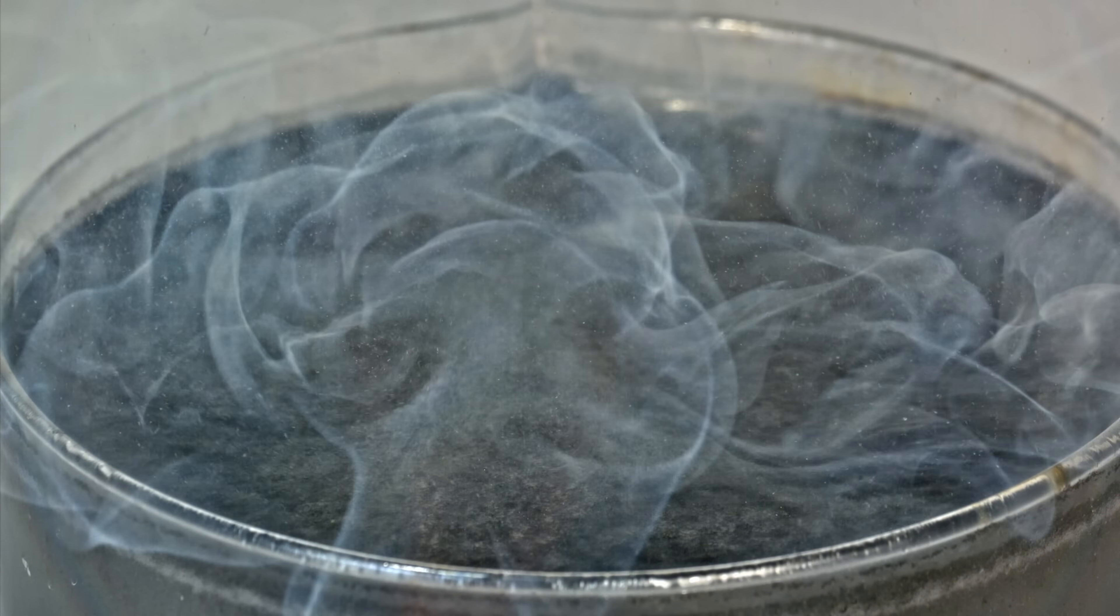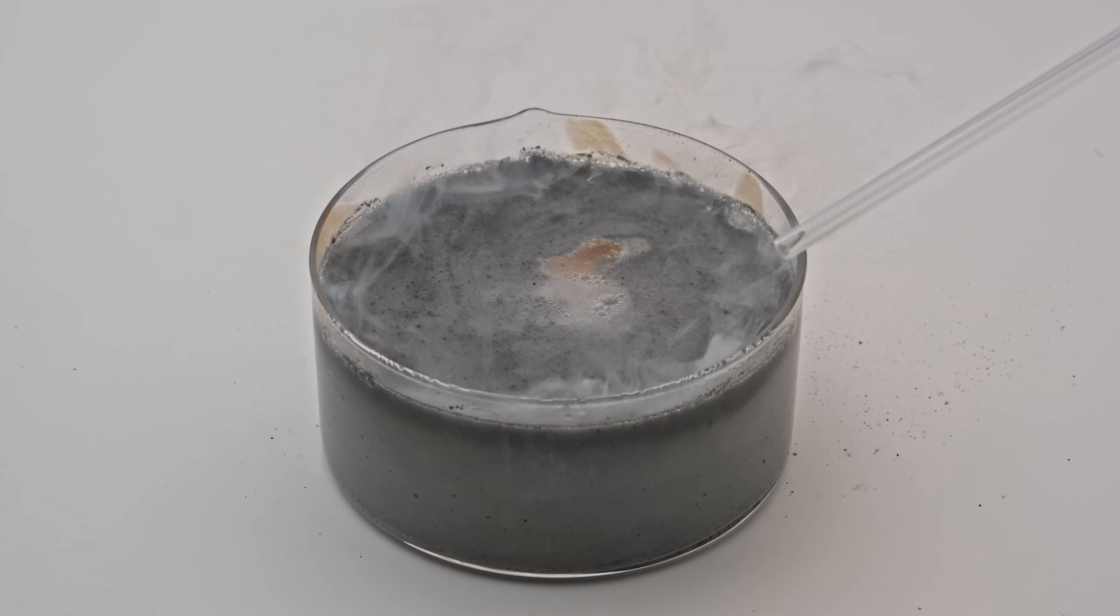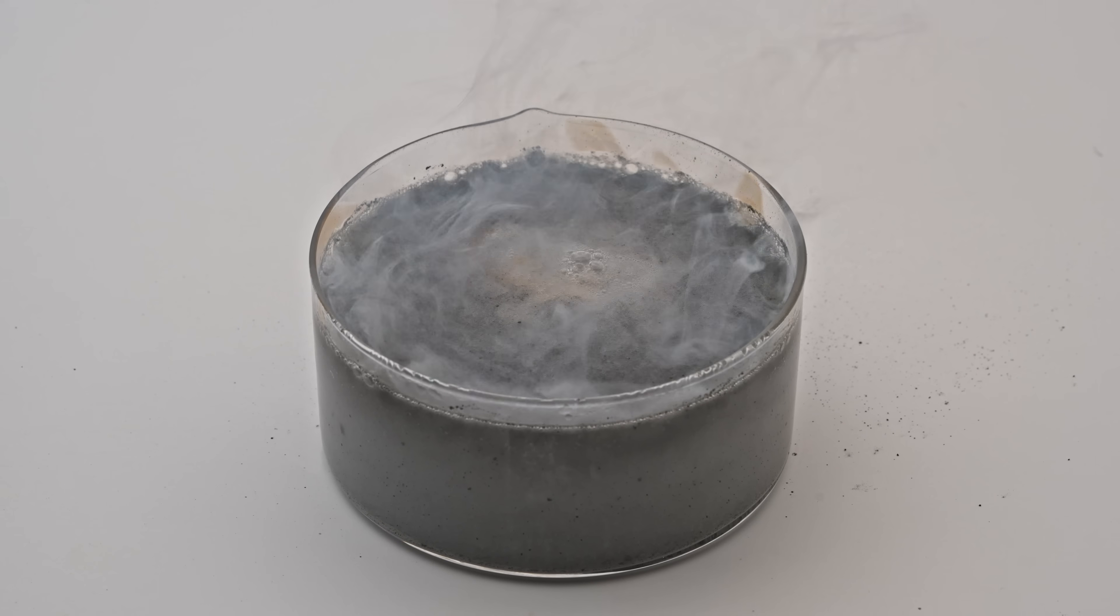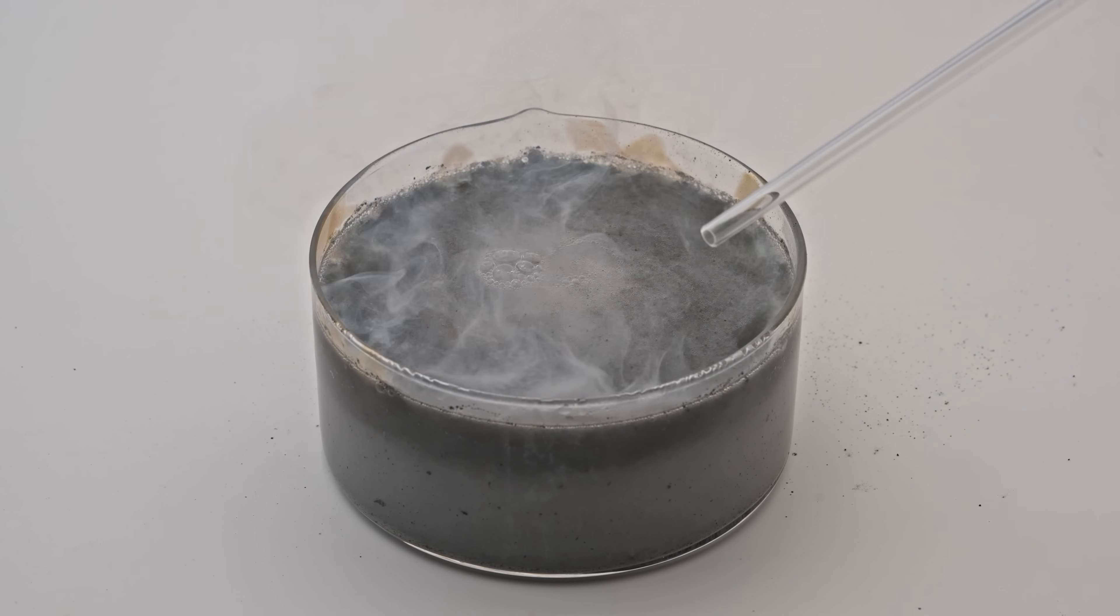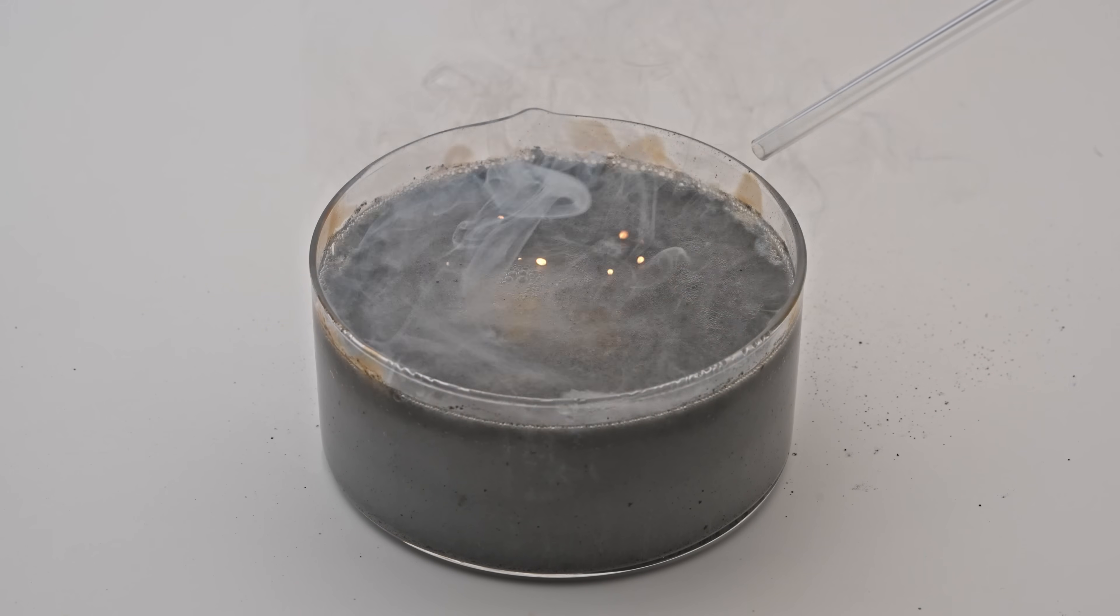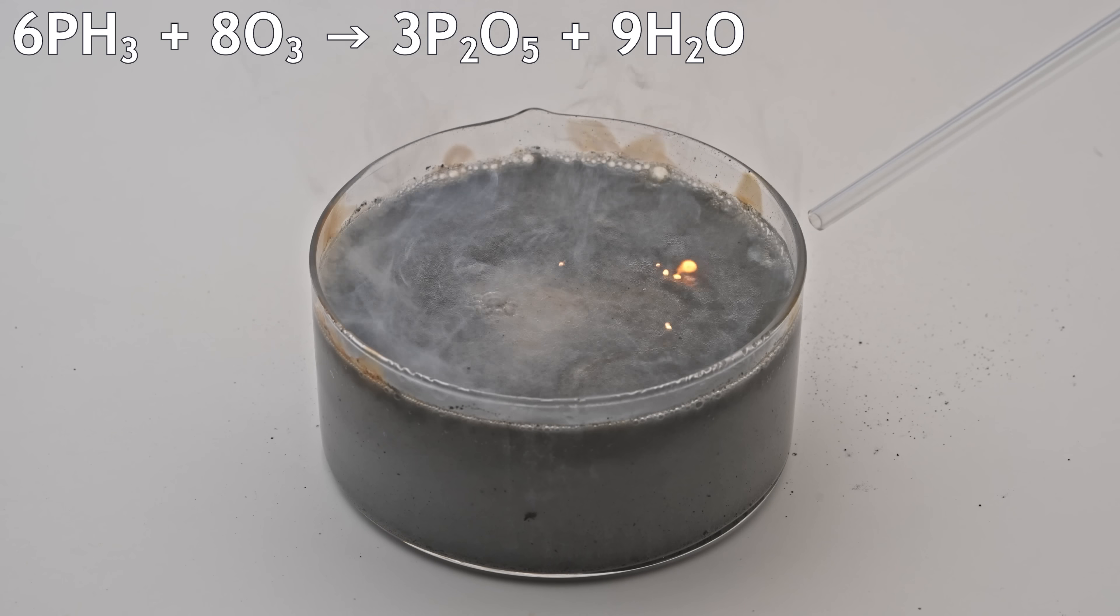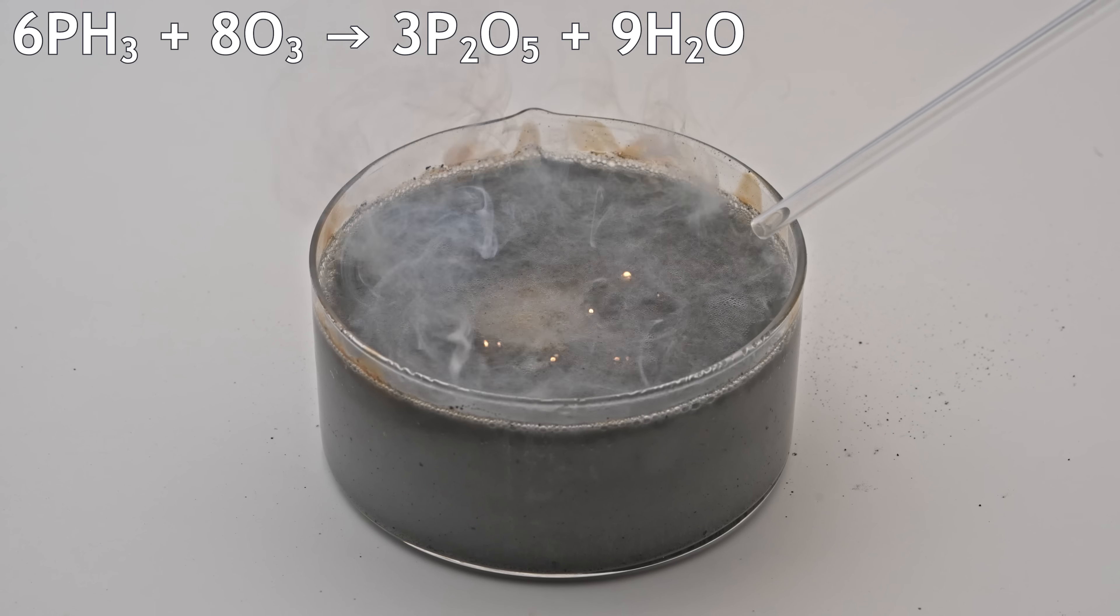Phosphine, which normally doesn't ignite in air on its own, bursts into flames instantly when it comes into contact with ozone. The phosphine gas bubbles pop on the water's surface, react with the ozone, and form clouds of phosphorus pentoxide smoke.